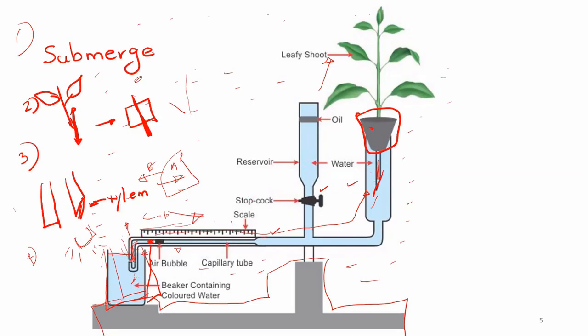Okay, in this way we can repeat the reading. Okay, so from that now you can say what's the purpose of this reservoir. What's the purpose of that reservoir?